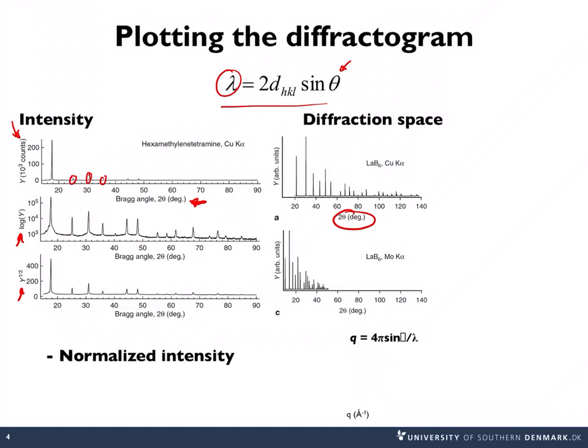We can see here where we change from a copper k-alpha to a molybdenum k-alpha. The pattern looks the same, but for the molybdenum data, which is a lower wavelength, the peaks are squished together at lower angles.